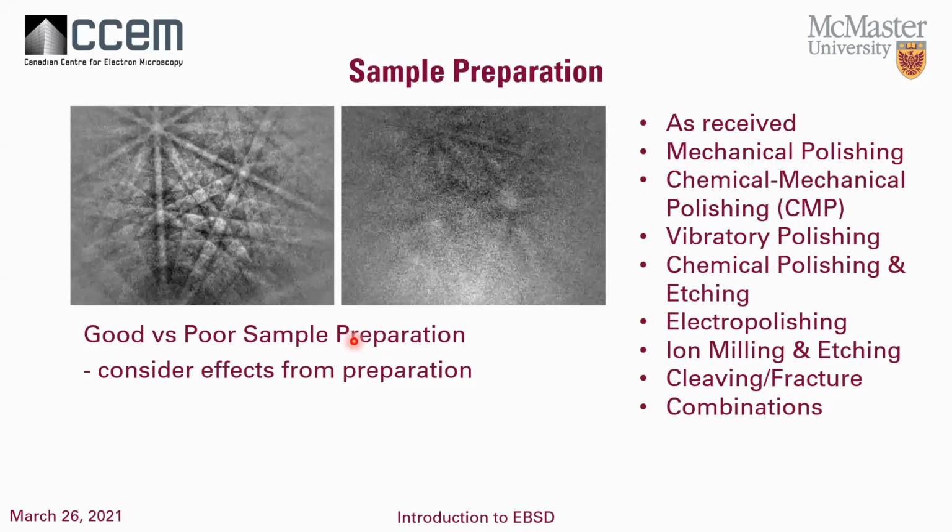Next thing we'll talk about is sample preparation. This is the bane of all people that do EBSD. It is the most critical thing. It causes the most problems in data collection, is getting a properly prepared sample. Now, this probably is a subject more on its own, so I'm just going to talk briefly about the sort of things you can do.